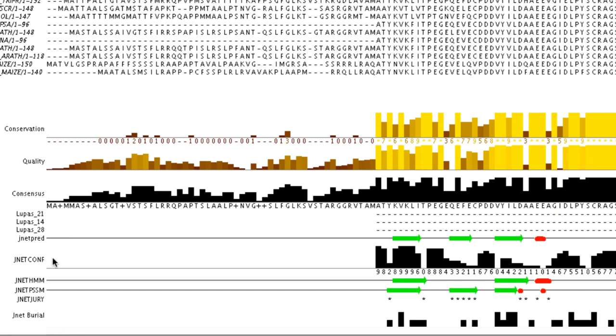The confidence estimates for the prediction are displayed in the JNetConf row. Higher values mean higher confidence in the accuracy of the prediction. The consensus JPRED prediction is generated from several outputs such as the HMM and the PSSM profile-based predictions. Their results are shown on the JNetHMM and the JNetPSSM annotation rows respectively.